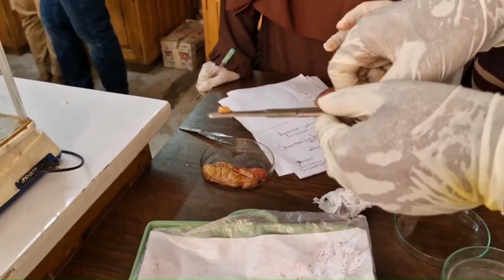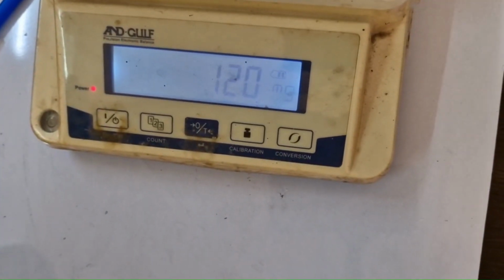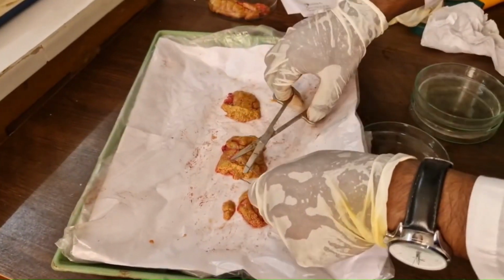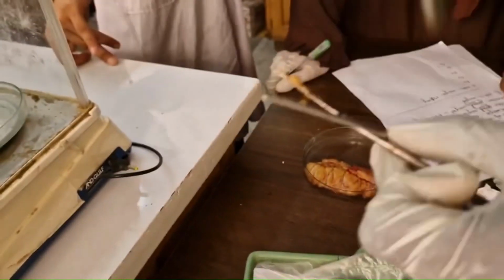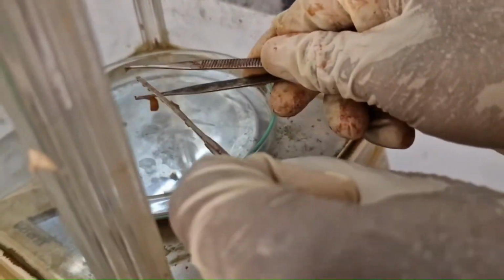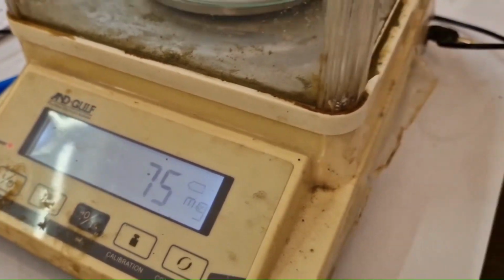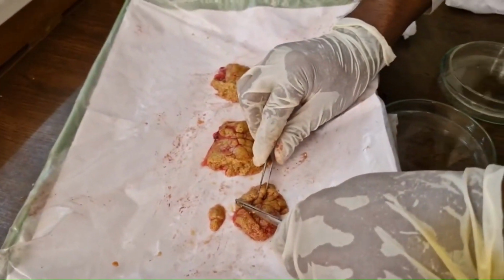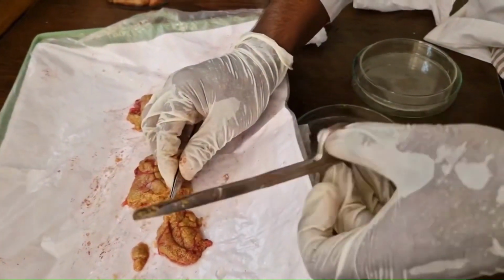Here, the F1 subsample weighed 121 milligram. F2 subsample weighed 75 milligram. And F3 subsample weighed 286 milligram.